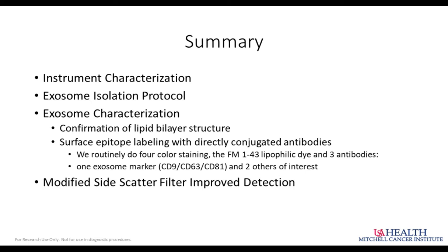I know several companies are working hard on generating the next generation of QC material, which is going to be a stabilized small vesicle in the correct size. That will give us the ultimate quality control standard because it's going to have the same refractive index as our exosomes. But for now, the silica microparticles are really the best way we have of assessing our instrument.